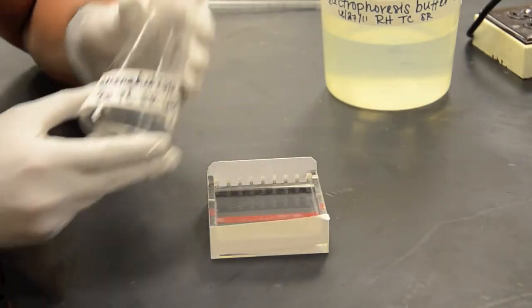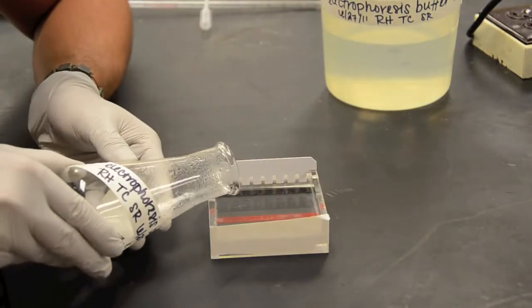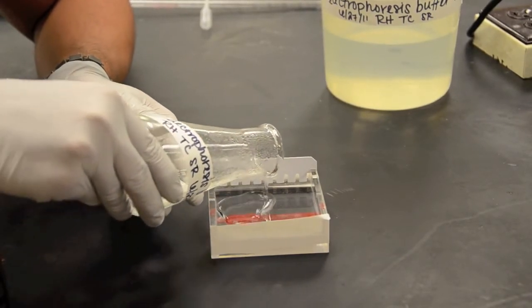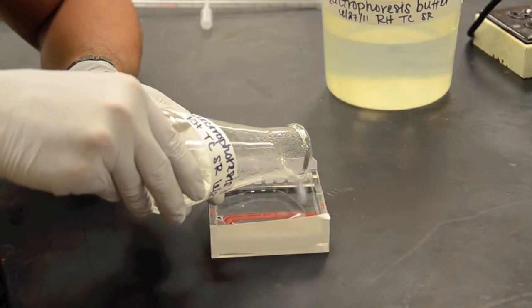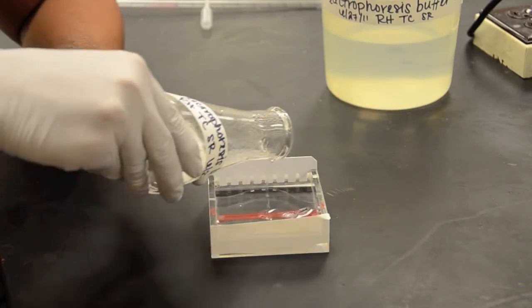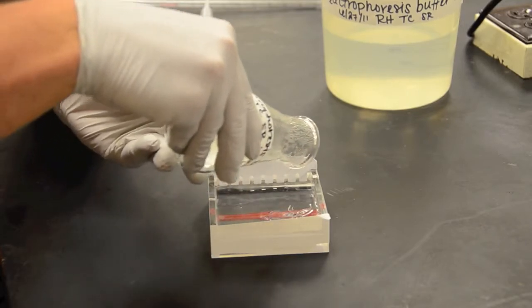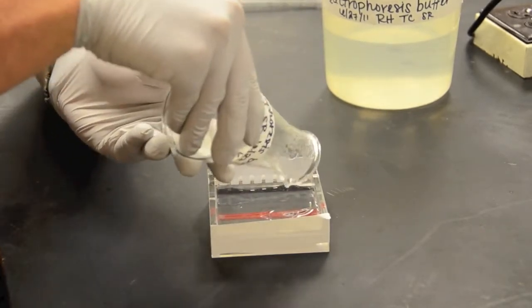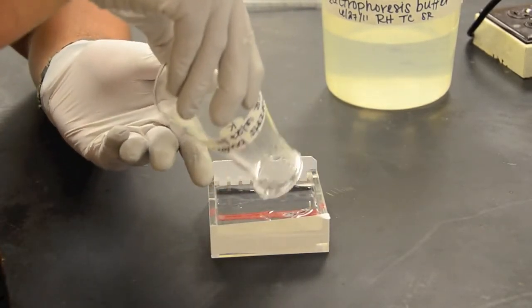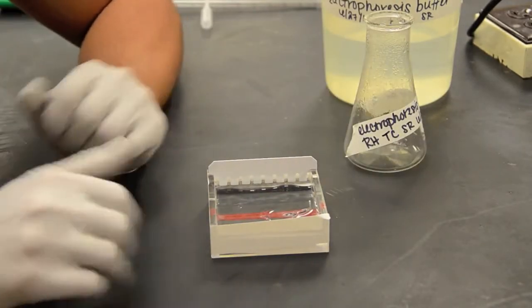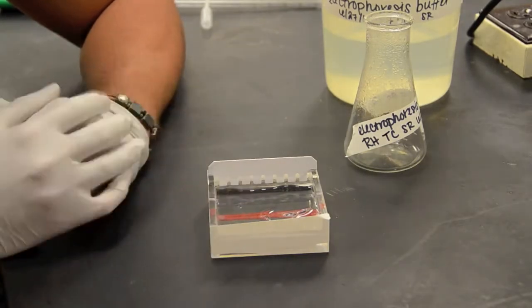So now that we've got it securely in place it is time to add the agarose gel. Make sure we get it uniform throughout, make sure it touches our corners here. Alright and what we're going to do is let this sit for 30 minutes until it solidifies and turns into our solid agarose gel.